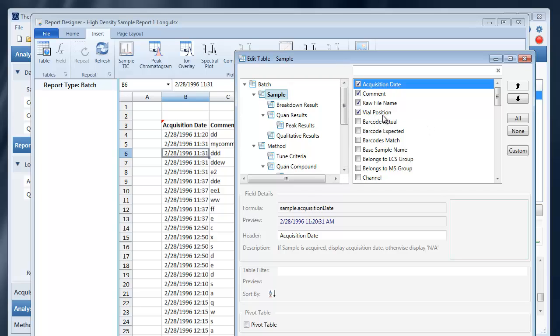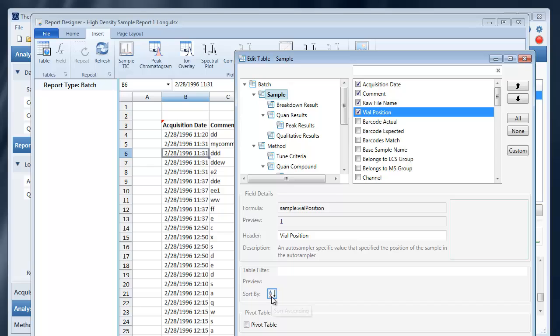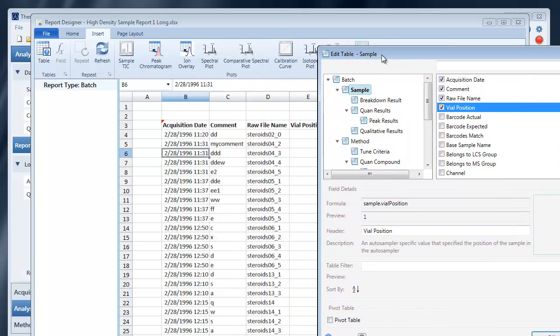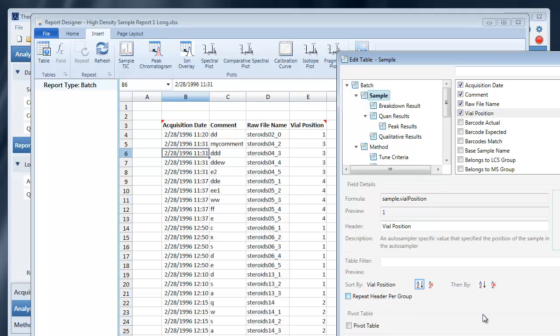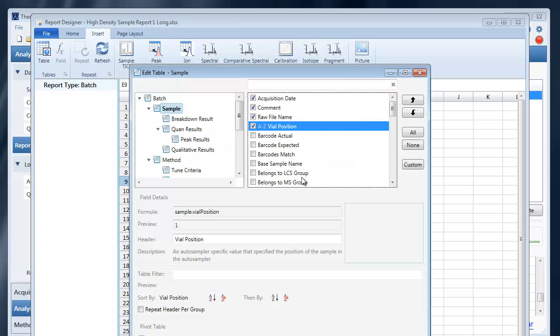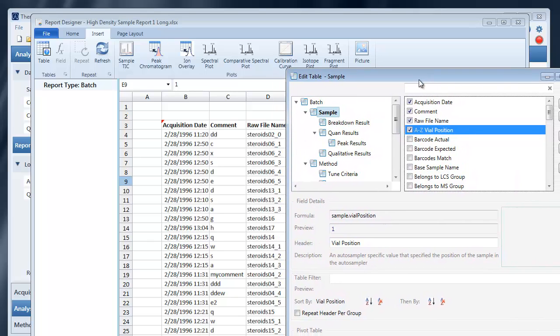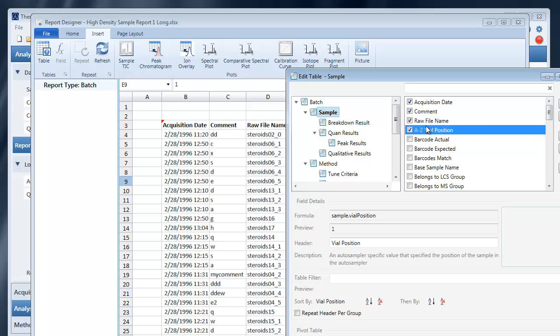You can sort on a column by selecting that column here and choosing this icon here. That will cause a sort to happen by that column.